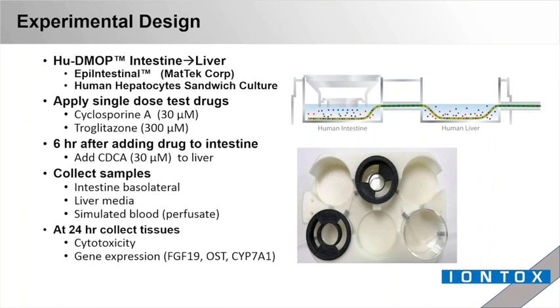And one of the key components to this setup and to our HuDeMOP platform is that there's no direct mixing of the media. With most all other multi-organ methods out there, there's a singular media that must be used and optimized for all of the tissues involved on the plate, whereas with our setup here, we can have each tissue in its optimal media because there's no mixing of the media.